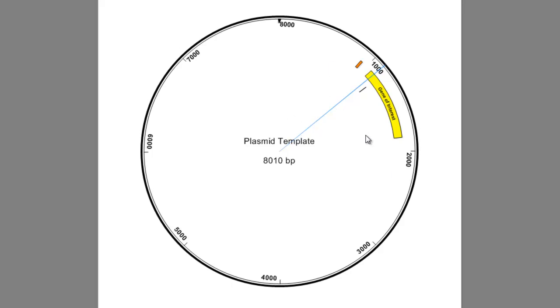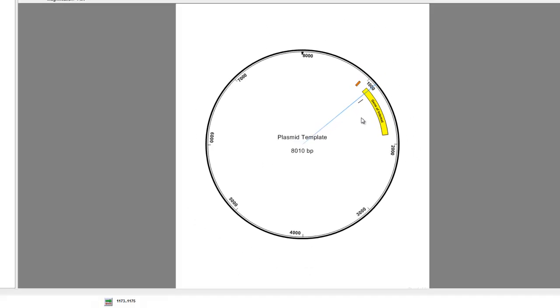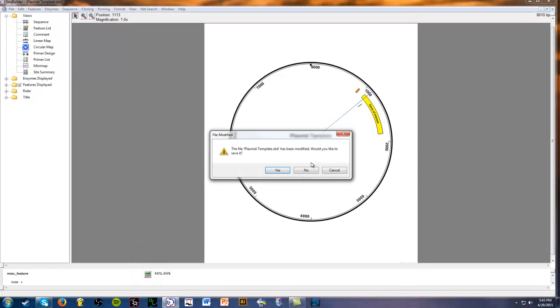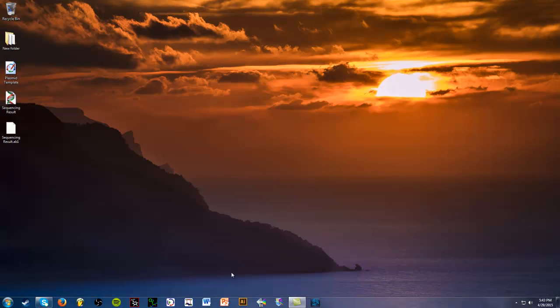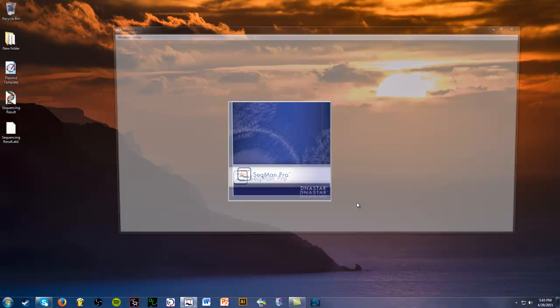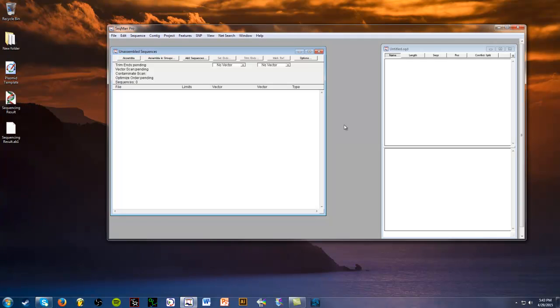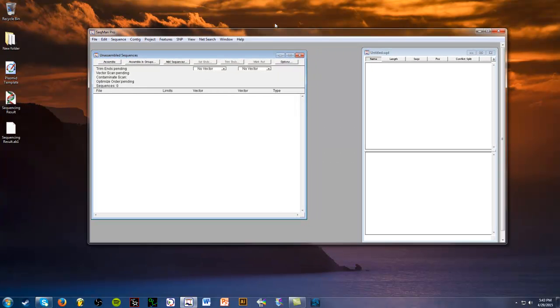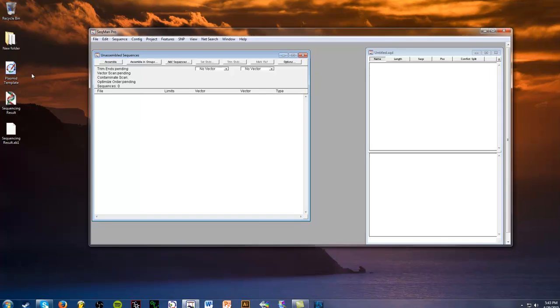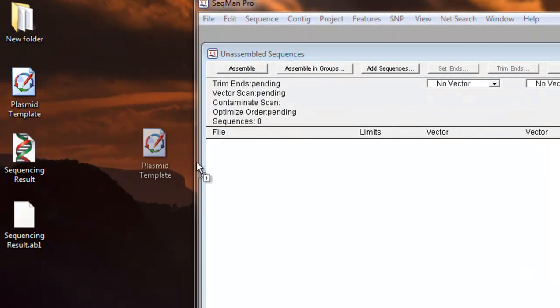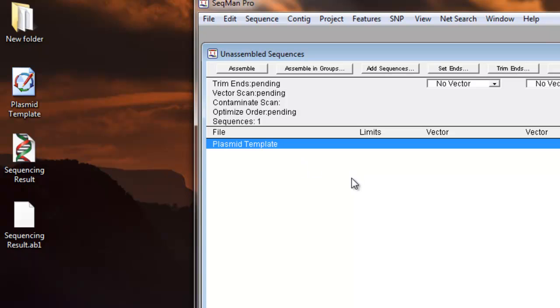Now that we have the template and we know what we're looking at, we're going to show you how to check your sequencing data. So we're going to close out of this. We're going to open up SIGMAN. Now that we have SIGMAN opened up, we're going to drag and drop our template. So the plasmid template, which I just showed you, is what we want our sequence to look like. So we're going to drag it in here.